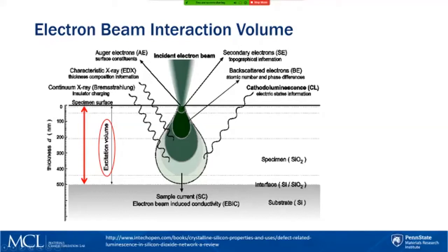The excitation volume is how deep it's coming from. So it's not just the surface of your sample. You're actually doing a bulk measurement.